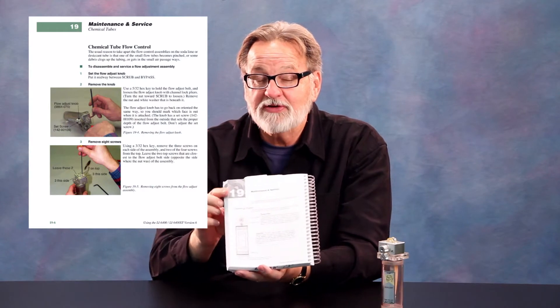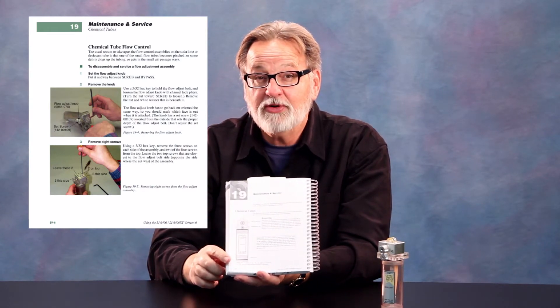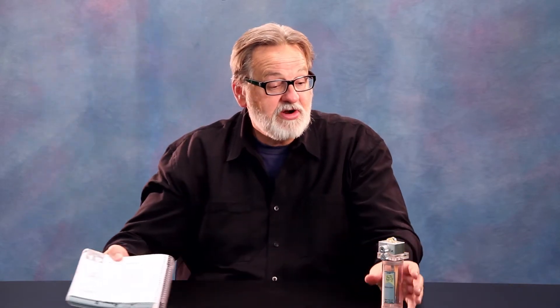The knob can become loose as a result of operation or it may need to be removed for maintenance procedures. Additional maintenance procedures can be found in manual book 3 of the LI6400 user's guide, specifically chapter 19, which also covers additional maintenance items for the chemical tube. Let's get started.